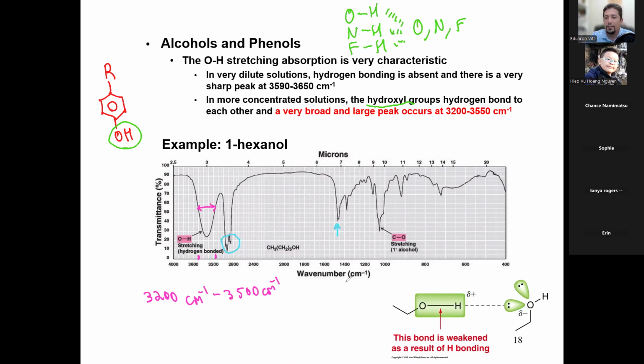And then, of course, even though you have the OH, don't forget that you also have C and then O and then H. This carbon-oxygen bond is polar, but it's a single bond, so it's weak. So you're going to see that at around 1100 right there. So at around 1100, you're going to see your carbon-oxygen single bonds from ethers, from esters, from carbon-oxygen hydroxyl groups. You're usually going to see that around 1100.